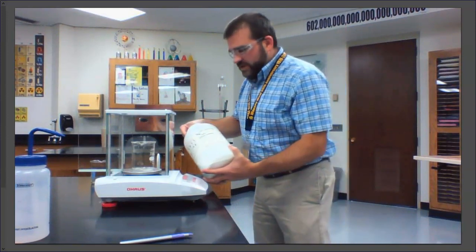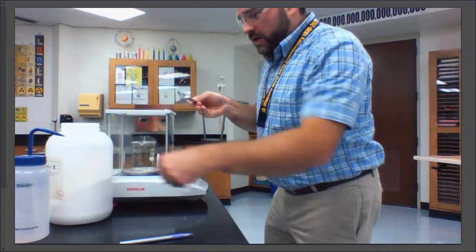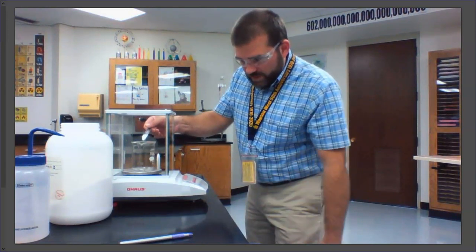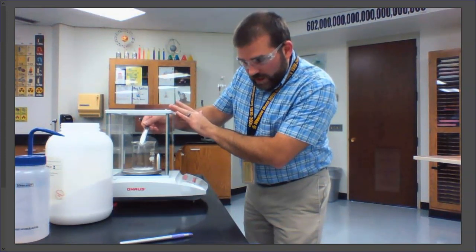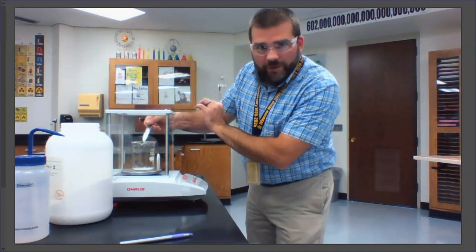So I grab some of this sodium carbonate, and now I'm going to use a technique that I learned in college. All right, so I have my full scoopula hanging over the top, and I want around 2 grams. I don't really care whether it's less than 2 or more than 2. I just want around 2. So I'm going to tap my wrist, okay? And when I do that, the powder slowly falls off so I can control how much I'm adding.